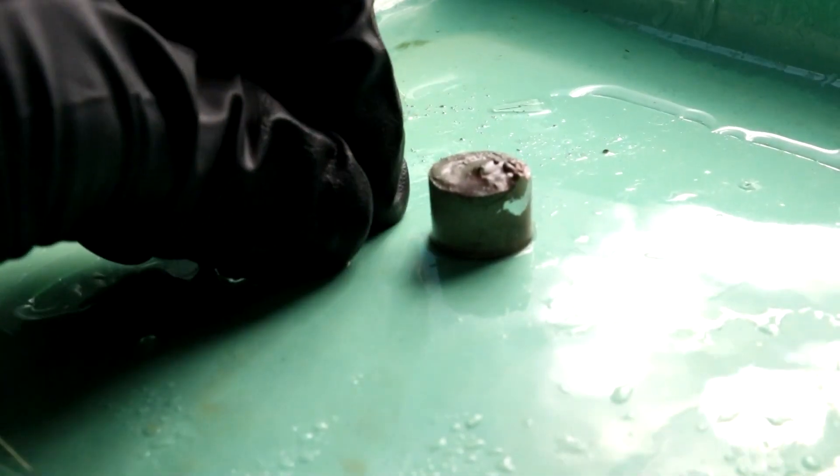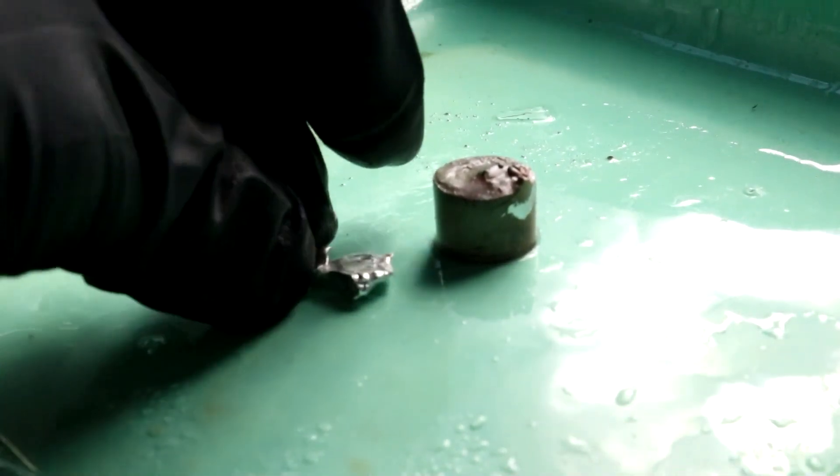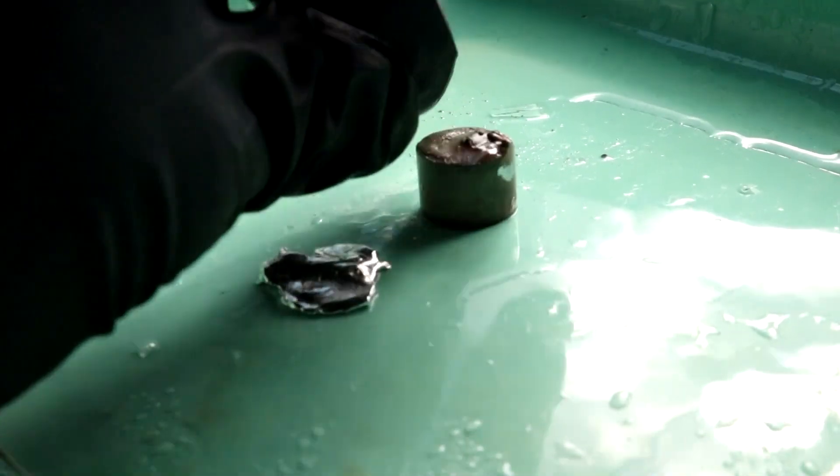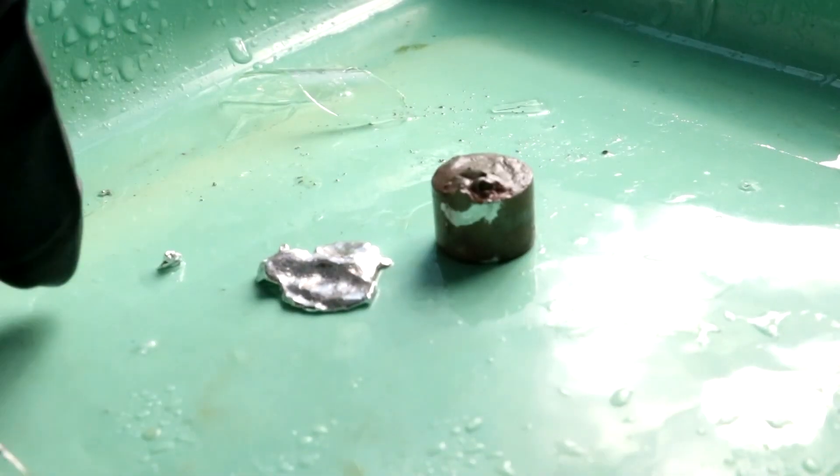In case you're wondering how I'm going to turn this back into mercury metal. Well, just heat it up to about 800 degrees Fahrenheit. And the mercury will boil right off. Of course to get it all out you would have to melt the copper.